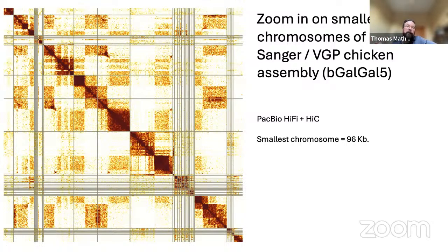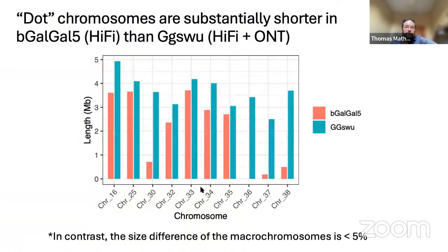It's not being able to place all the repeat content, because often in birds you find there's a lot of shrapnel left at the end of the assembly, which hits so many places in the genome you don't know where to place it and you have to leave it out. But also there's something else going on.